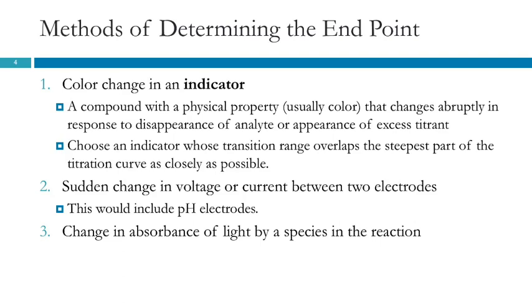You did an experiment like this in Chem 1B with the unknown weak acid, where you had your unknown acid in a flask, well actually in a beaker, and you added the sodium hydroxide in small increments and you recorded the pH. And then when you got closer to the endpoint, you added it in smaller increments and recorded the pH. And so you were able to generate on the computer this whole pH curve.